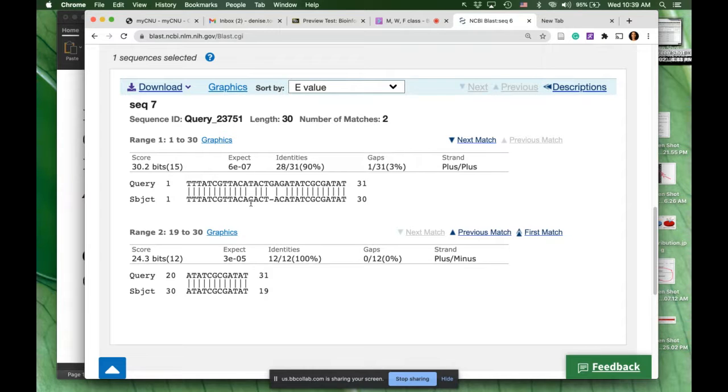But in this case, it's just the two bases that are not the same. And earlier, just now by mistake, I said here is a lack of a line, but that's a different case. So this is a mismatch, this is a mismatch.